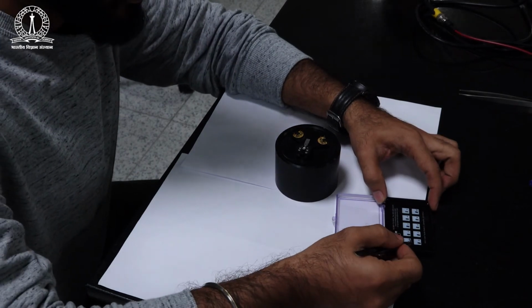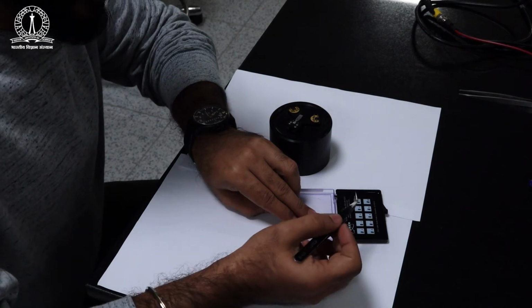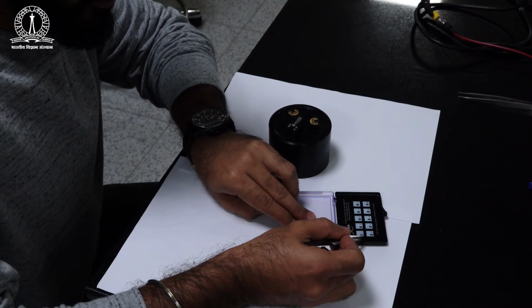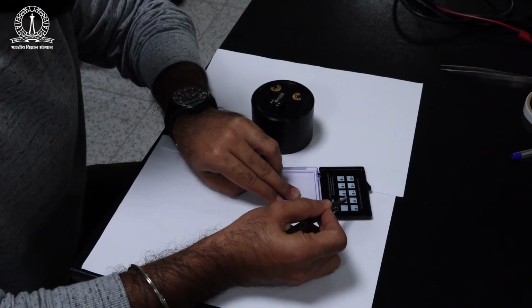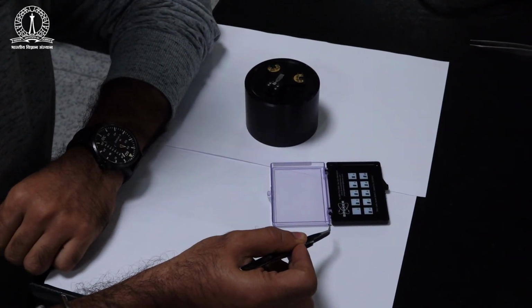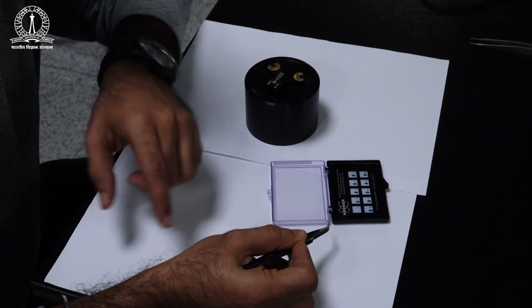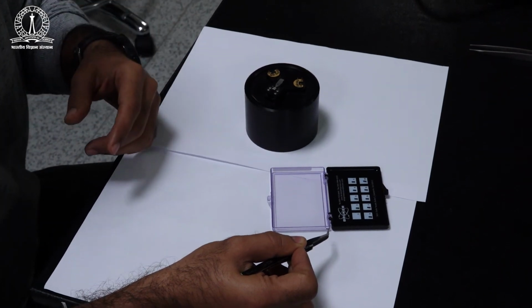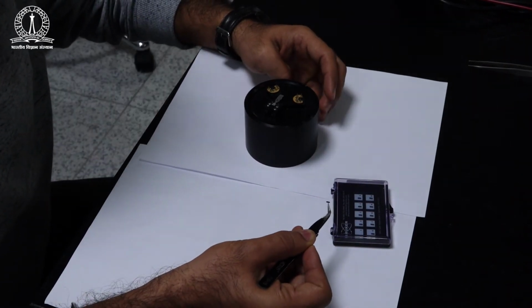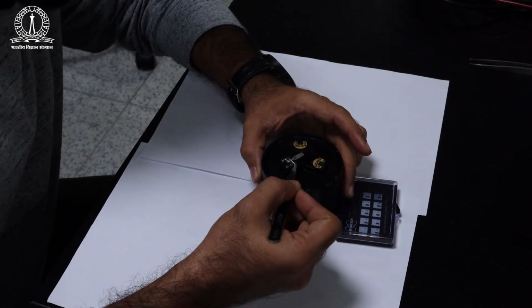So how we load the cantilever to the tip holder is this. This is a sharp tweezer that we use, and we pick up a cantilever like this. But what we are handling with the tweezer is not a cantilever directly. It's the base that was shown in the presentation. So the base contains the cantilever and the cantilever contains the probe. So it is held like this, then loaded onto the tip holder like this.